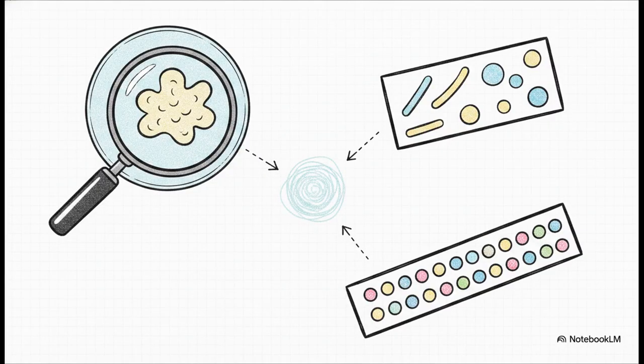To turn that giant pile of data into a definitive identification, we follow a really strict pathway. We combine morphological classification, so documenting the macroscopic architecture of the colony and the microscopic cellular shape, with chemical staining analysis, running differential protocols like the Gram or acid-fast stains. Then we fold in metabolic testing data using comprehensive multi-well strips like the API 20E system, which rapidly profiles exactly what nutrients our unknown organism is eating.